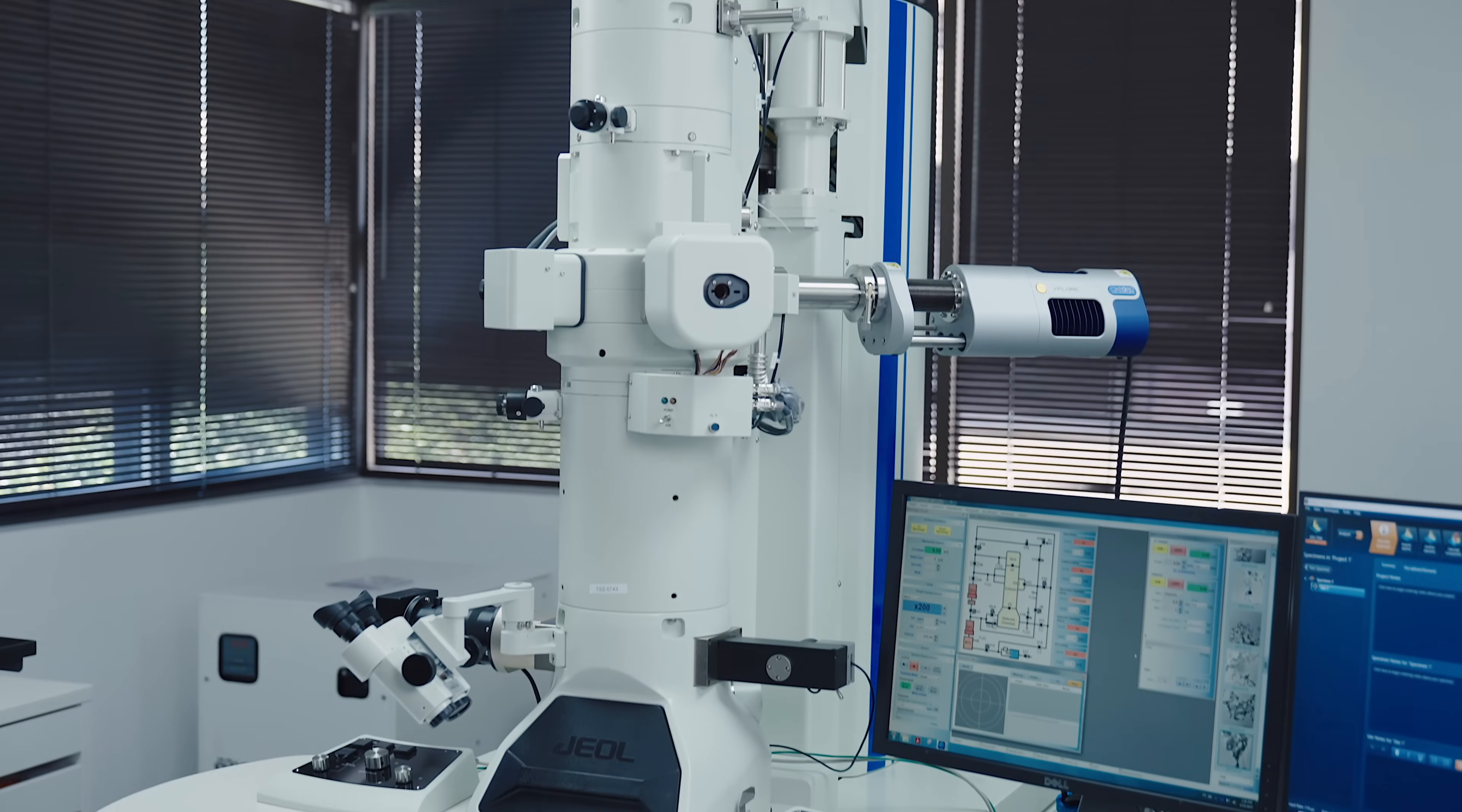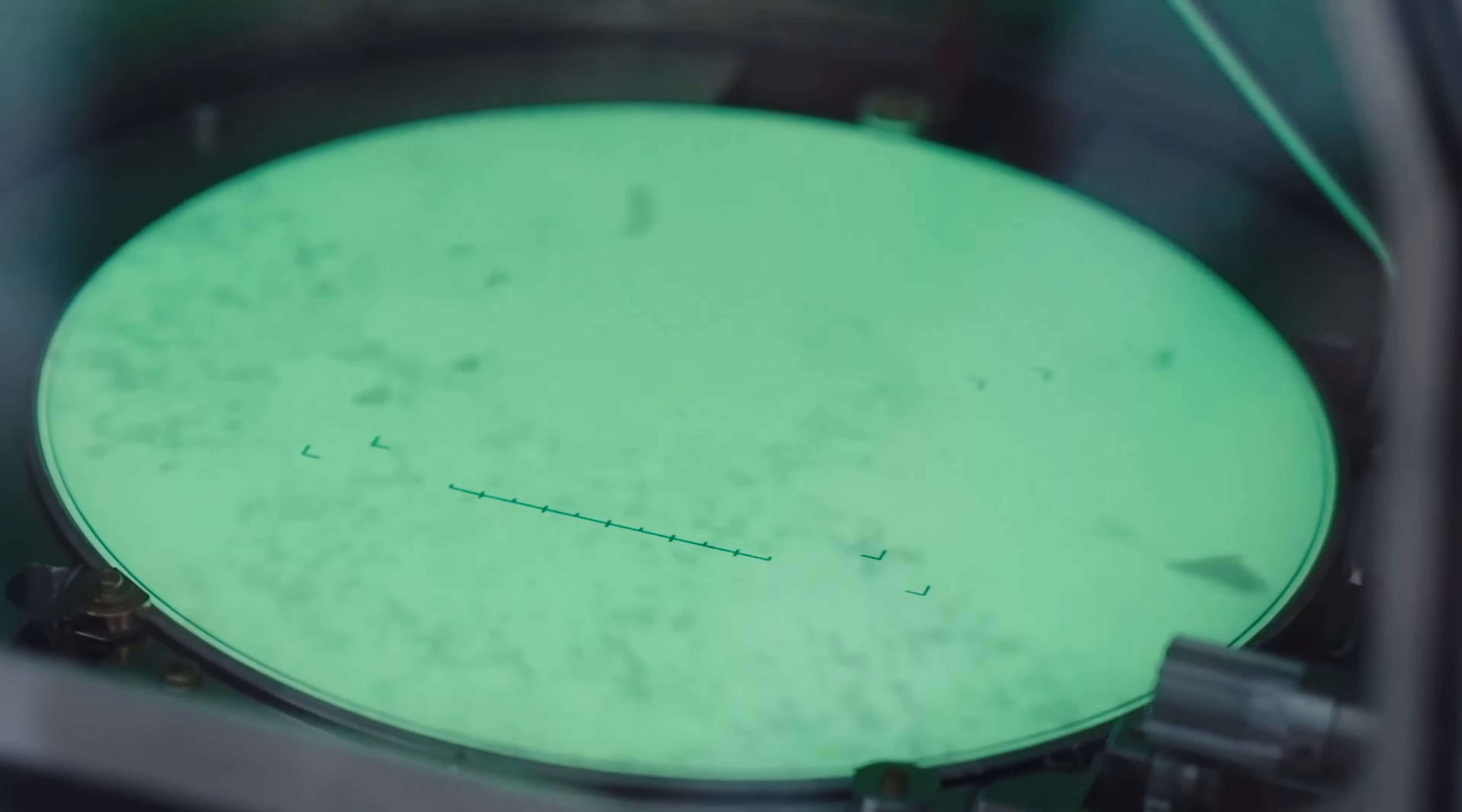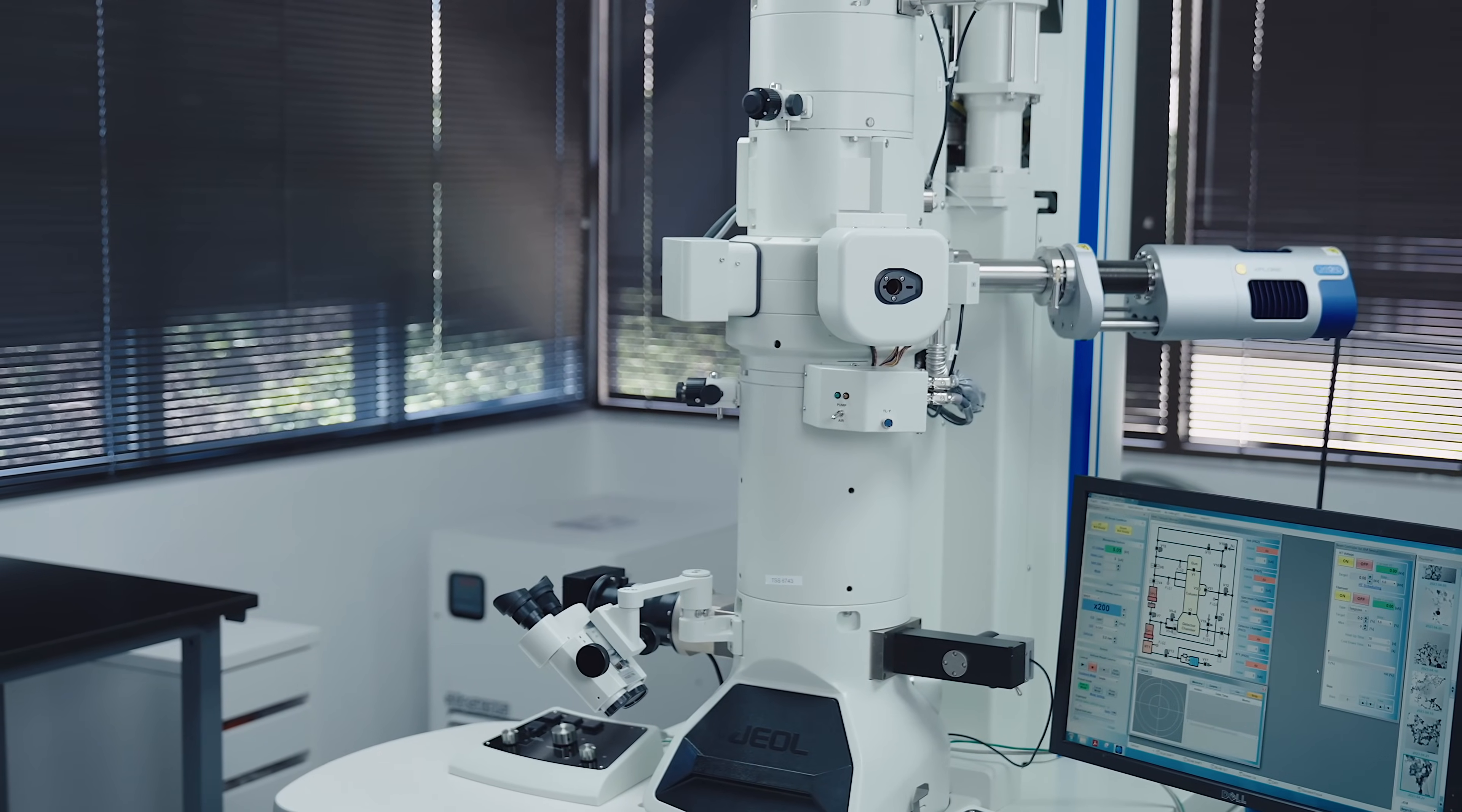This machine allows us to examine samples at a much higher magnification than we would be able to normally. It also allows us to examine for elemental composition. Both of these things allow us to look at such sensitive items as combustion byproducts such as soot, as well as being able to determine chemical composition of asbestos in the sample.